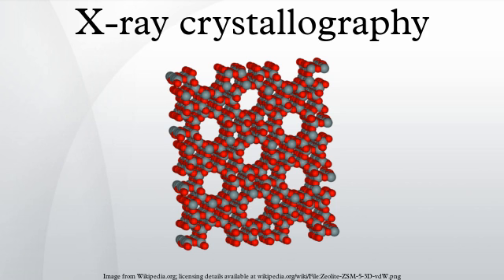Molecular replacement. If a related structure is known, it can be used as a search model in molecular replacement to determine the orientation and position of the molecules within the unit cell. The phases obtained this way can be used to generate electron density maps.